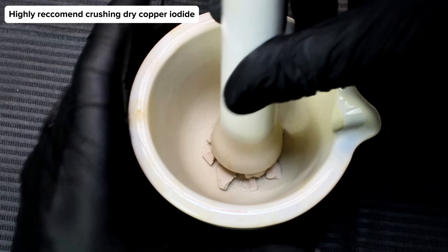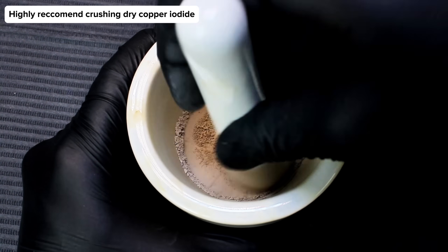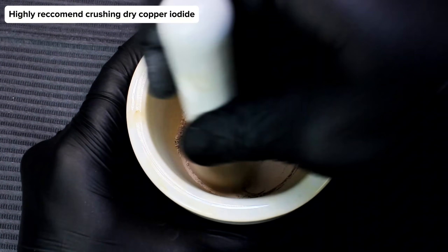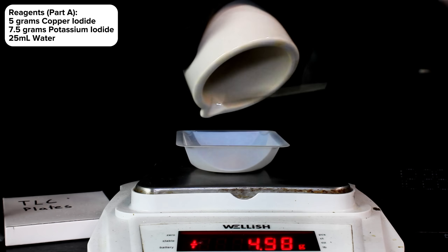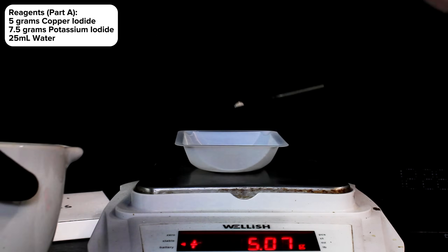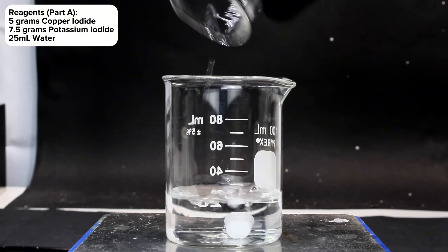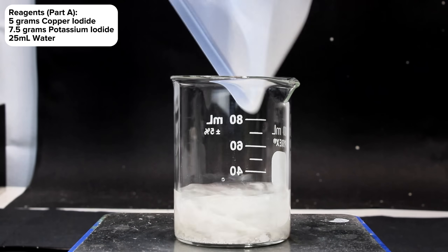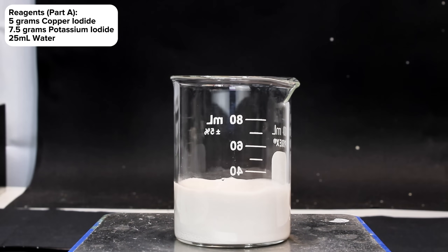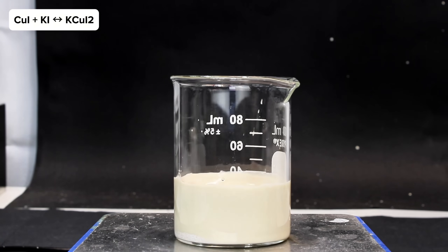After letting the copper iodide sit overnight, it had dried completely, and now it was time to start making my glowing copper compound. To do this, I first transferred 5 grams of copper iodide to a beaker, along with 7.5 grams of potassium iodide and around 25 milliliters of water. While copper iodide is nearly completely insoluble in water, it can form a soluble complex with excess iodide, resulting in a mixture containing both solid copper iodide and the soluble complex, which discolors it a light yellow.